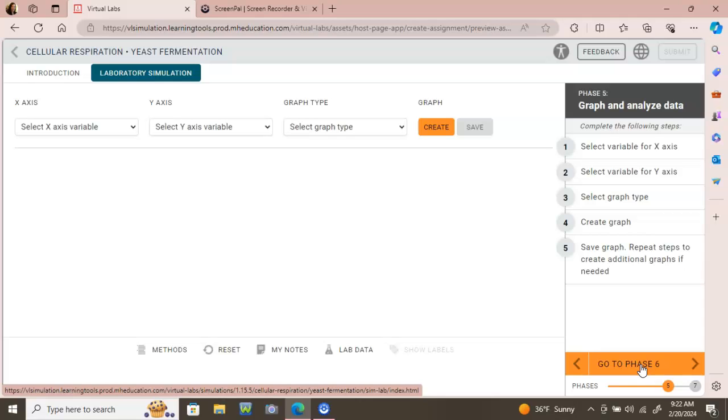I don't know if the reason that you're seeing the same values is because it looks like you put everything into the water bath and then took the tubes out, but maybe double check, try and go through it again, and let me know if you're still having the same issue.